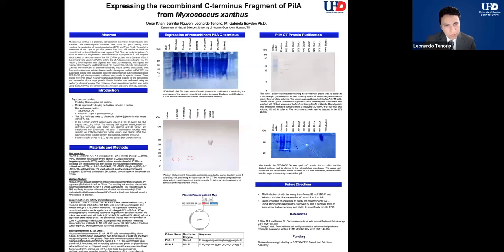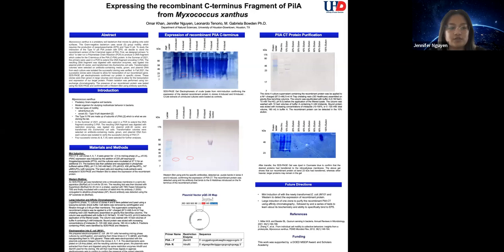Thank you, Leonardo. So the first step of the Western blot, as Leonardo described, was the gel electrophoresis, and this was to separate the sample's proteins. The next step after that is we're going to transfer those separated proteins out of the gel into a nitrocellulose membrane. Now, on the N-terminus of the recombinant protein, we introduce the anti-histidine antibodies that bind to the 6-histidine. Our recombinant protein was detected with the anti-His tag antibody in the bottom left image.